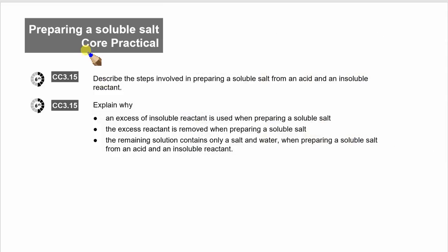So in this video we're looking at a core practical, preparing soluble salts. You could get a 6-mark question on this, whereby you'd be describing the steps involved in preparing the salt and explaining the significance of each step, what's actually taking place, why you're doing what you're doing.